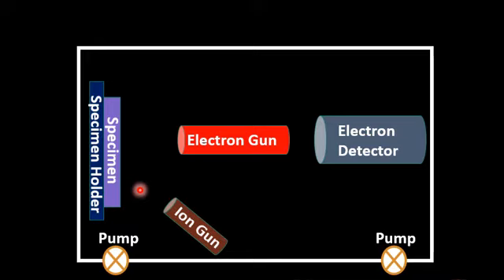As Auger electron spectroscopy comes only from a few atomic monolayers, a material surface may absorb different kinds of gases. So basically the Auger electrons are very sensitive. So in order to get an Auger electron from the specimen, the role of the ion gun is very important, and the ion gun removes the physically absorbed gases if they are present on the surface of the specimen.